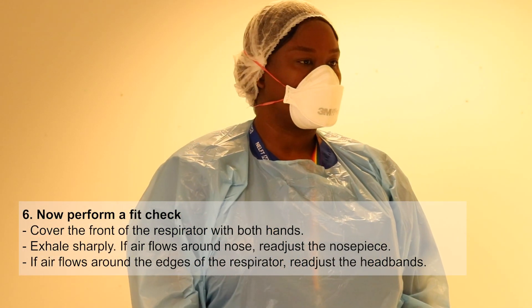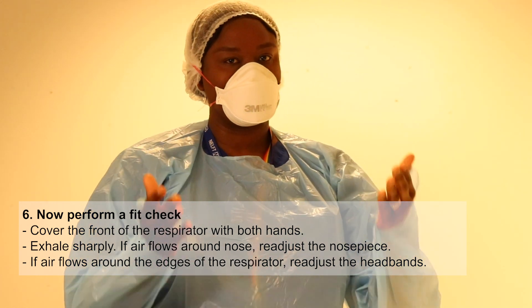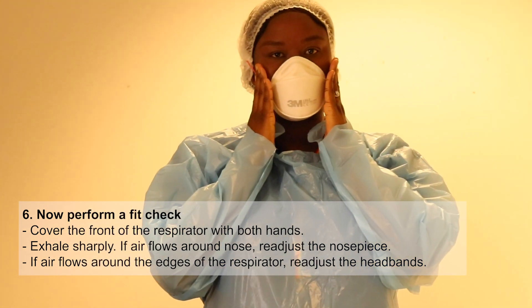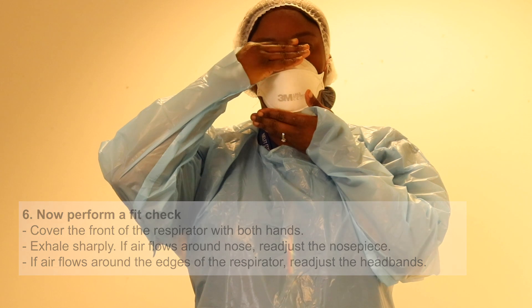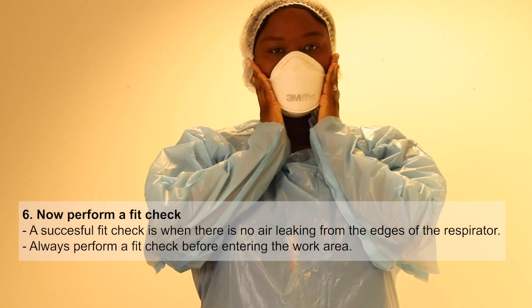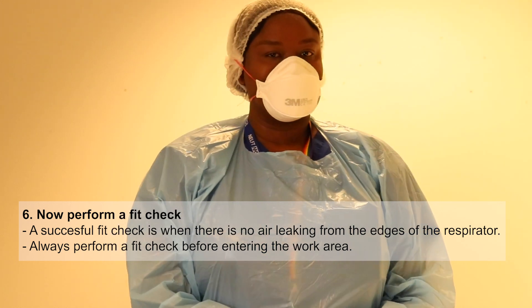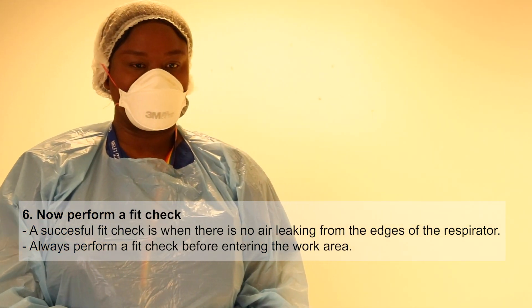This is the most important bit — you would do a fit test on it. You put your hands each side and blow, and also at the top, to see if you can feel any air coming out. That's your check that you have to do every time. When you're happy with that, you can then put your eye protection on.